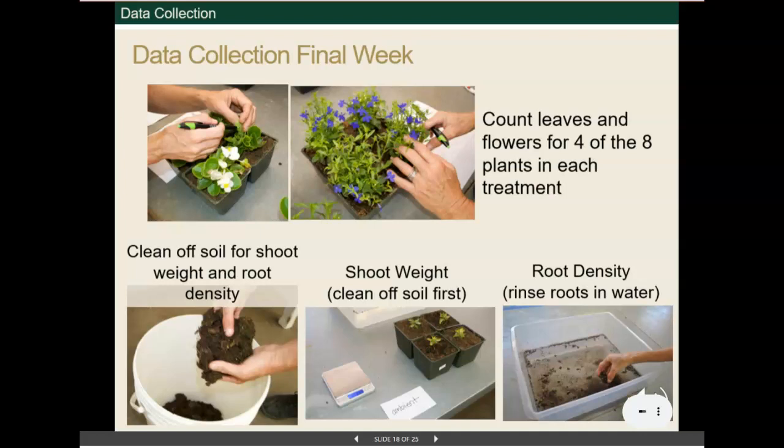In a more professional experiment, you might use a dry sieve method by using a sieve with a small mesh size to clean the roots to remove more soil, by shaking them in the sieve with a lid cover. There are also protocols to wet sieve roots to remove all of the soil from the roots. Both processes are very tedious and unnecessary for the purposes of this class.